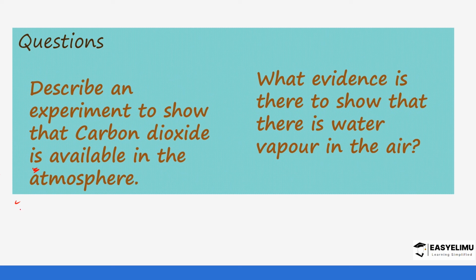Sodium hydroxide pellets were left exposed for some days.